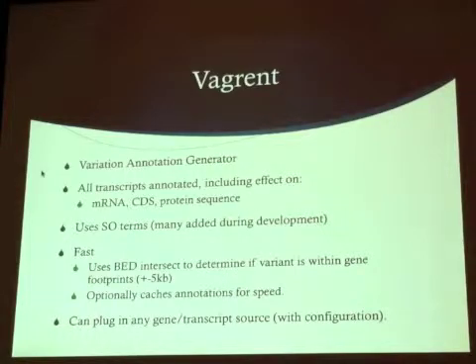It also is fast. When you set it up, you run some scripts which generate bed files which say, here's information about the gene locations, very gross, large information. So if a variant is in your data set which is nowhere near a gene, and I stress nowhere near, because we do annotations for upstream and downstream for 3,000 and 5,000 base pairs and possible effects that they could have on some transcripts, it basically will never even attempt to generate an annotation, it'll just say no annotation, because it can just do an intersecting file.